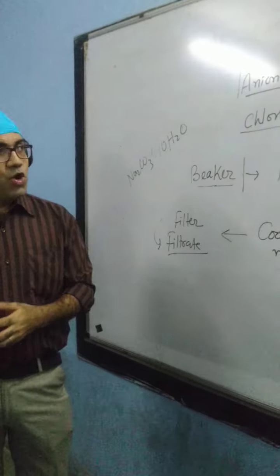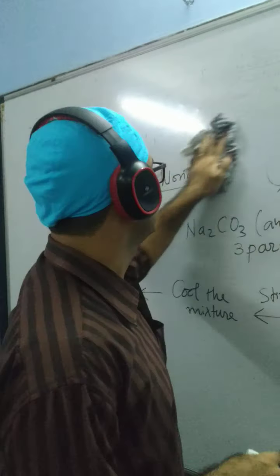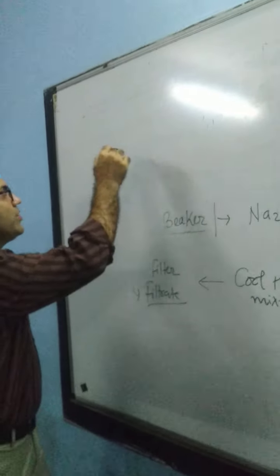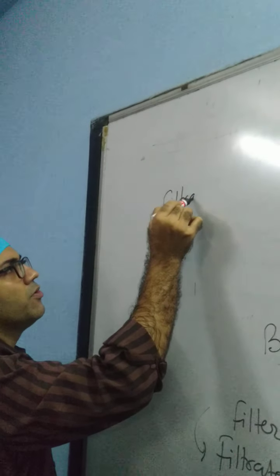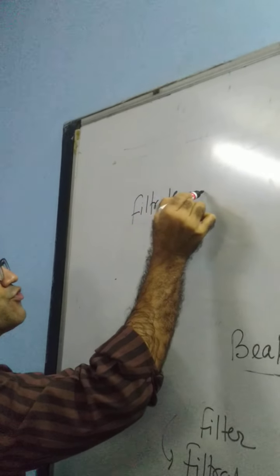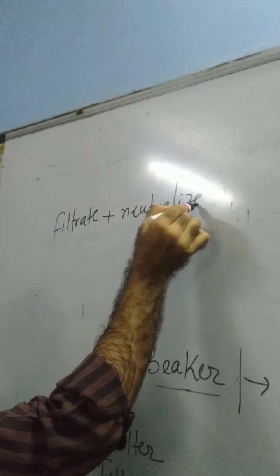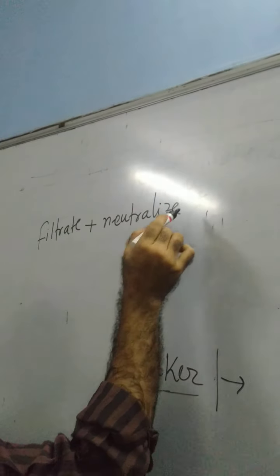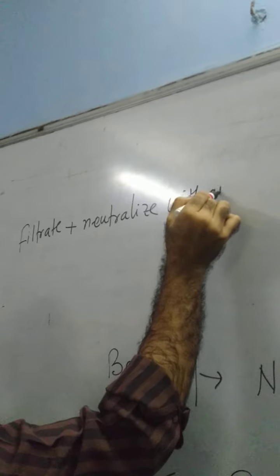Okay? This filtrate now, what will we do with this filtrate? We will neutralize this filtrate. With which acid? We will neutralize with an acid.